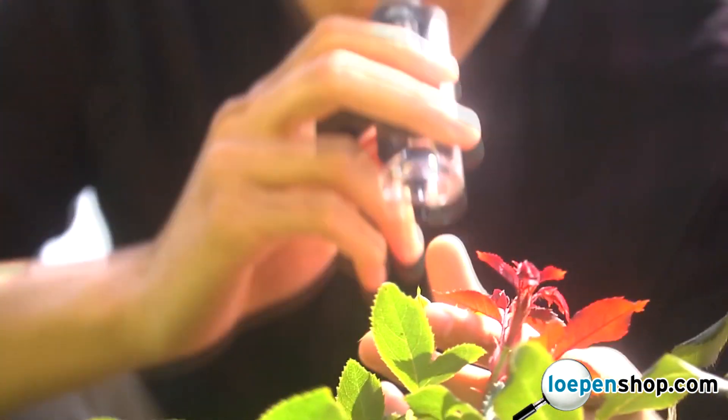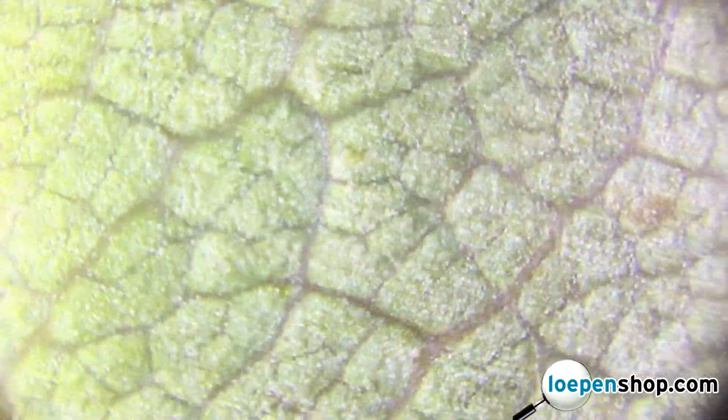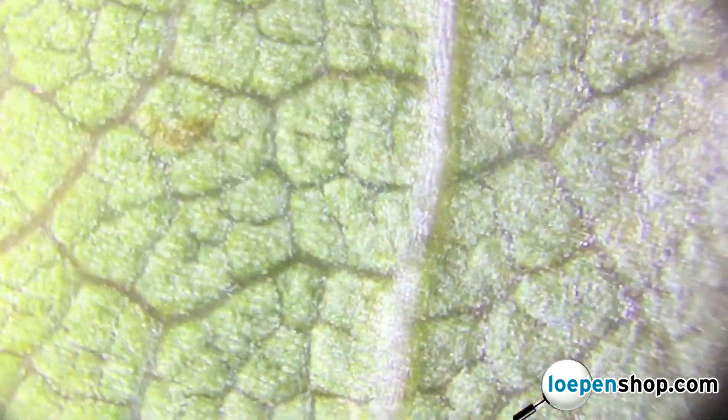The MicroMax can be used indoors or outdoors. The handheld design works really well for inspecting plant life. Since the optics are nice and powerful, you'll be able to see details that the naked eye just can't see.